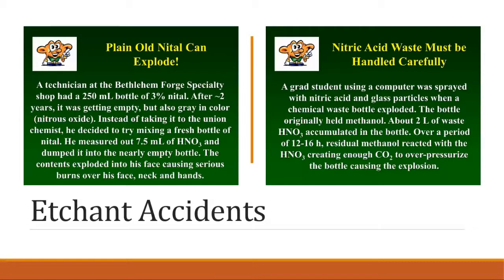The other one is a grad student using a computer, who was sprayed with nitric acid and glass particles because the waste bottle exploded next to him.